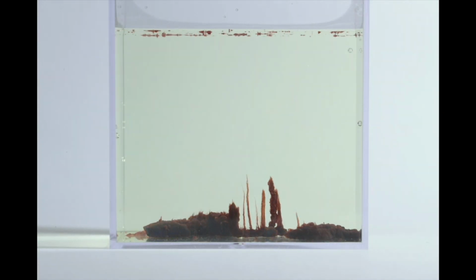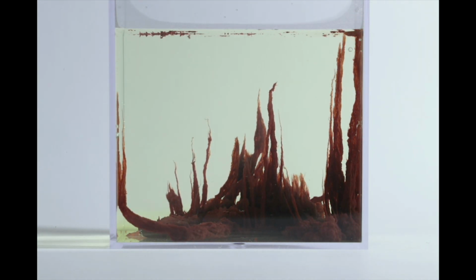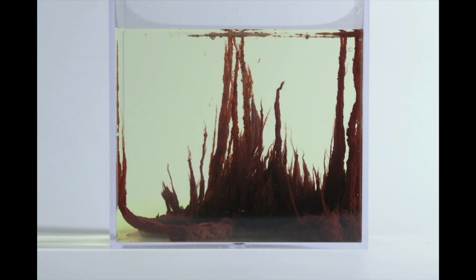Welcome to our video. Today we will learn about solutions in osmosis by making artificial cells, also known as Traube cells. These chemical cells mimic plant cells as they expand and grow taller. Let's look at the process.